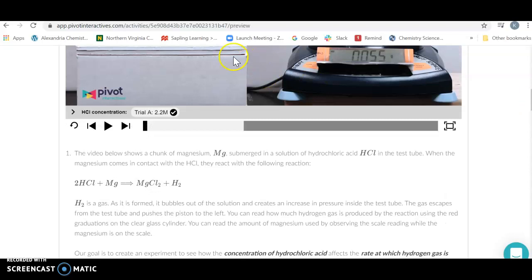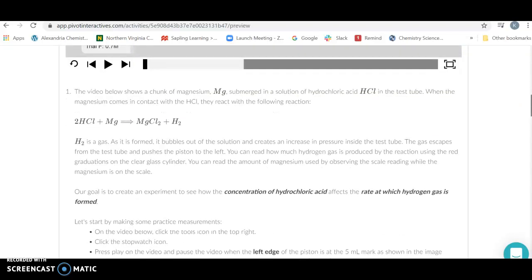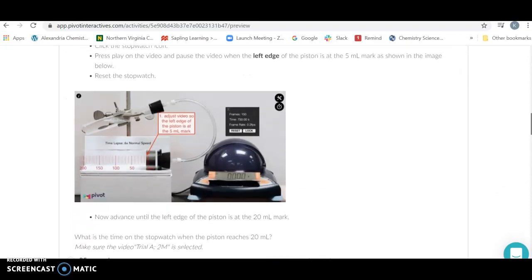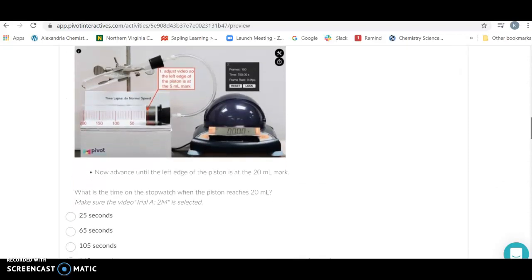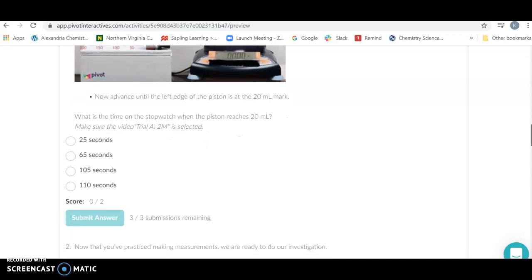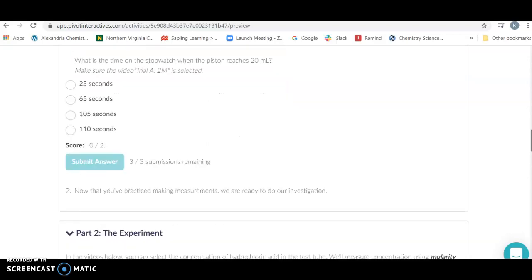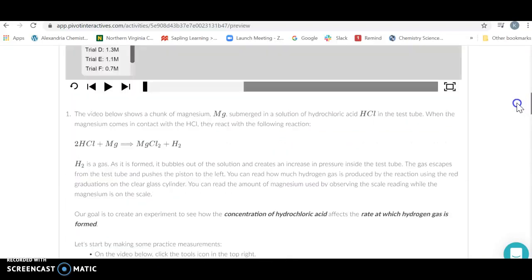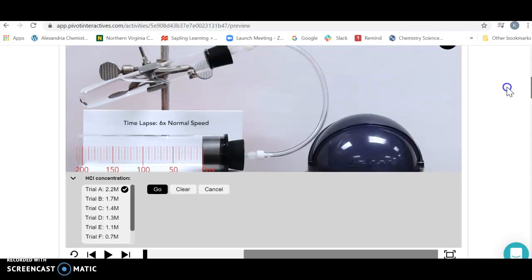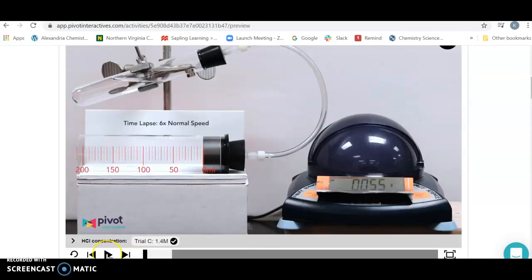Our concentration is going to vary as we go through different trials. We're going to record our data - how long it takes for 15 milliliters to be produced. Let's see how to do this because it takes a little bit of finesse. I'm going to select 1.4 molar. Make sure you click on go because it's actually going to start and react.